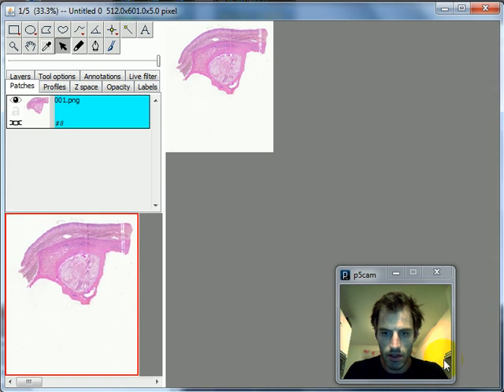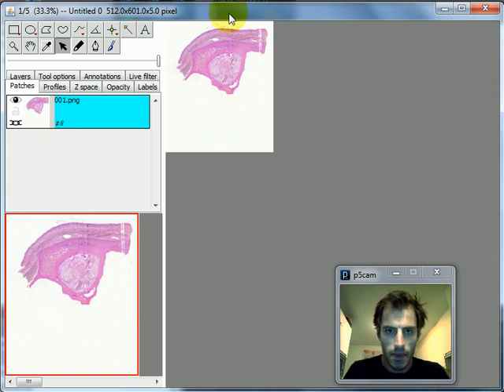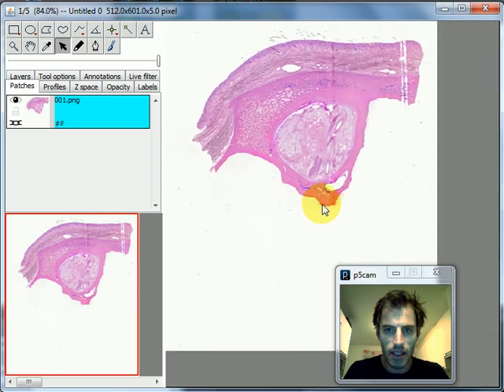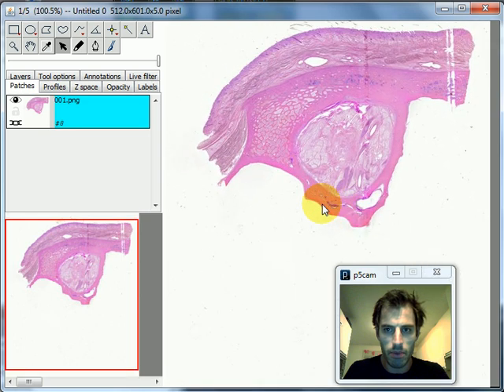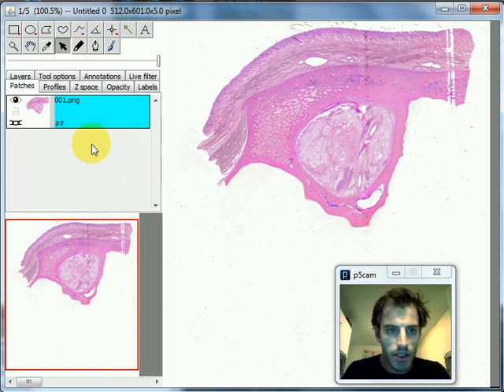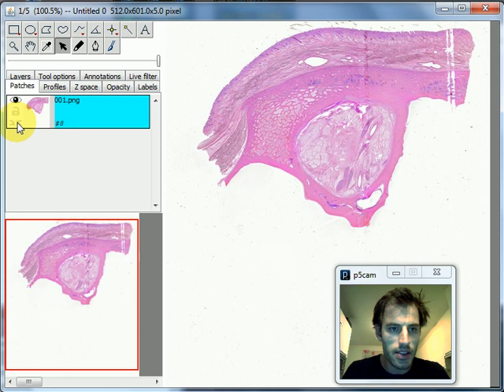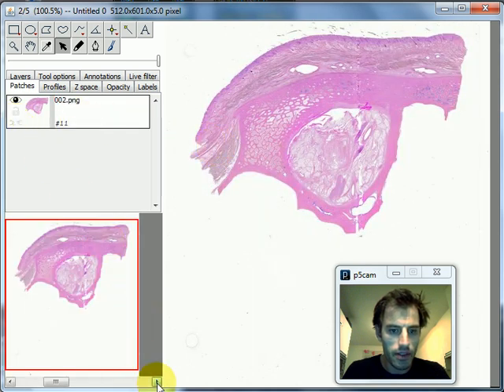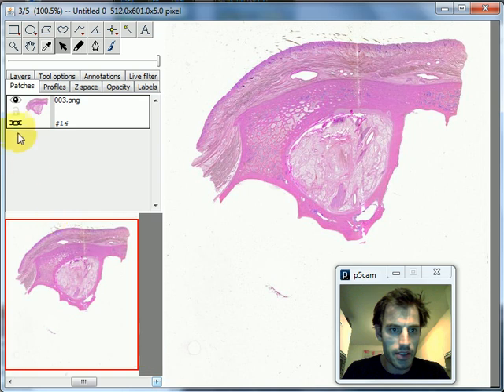I'll resize the window over here and zoom into the slice. I can do this automatically, but the point now is to show you how to do this manually. Very importantly, I have to unlink these slices because I'm going to move them relative to their layers.